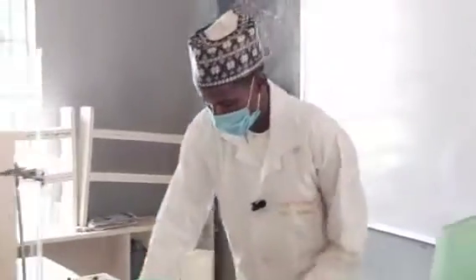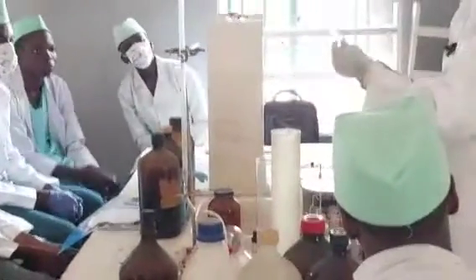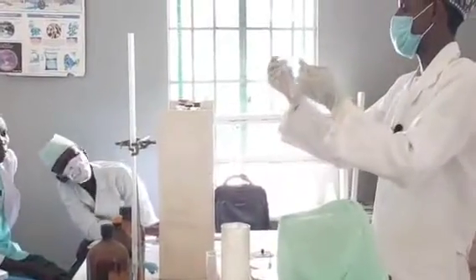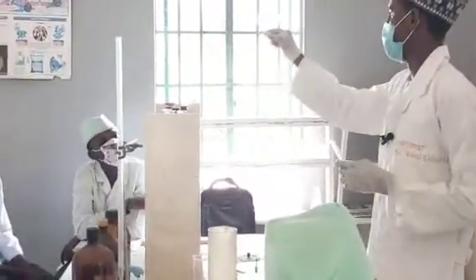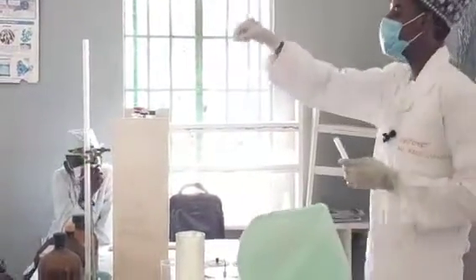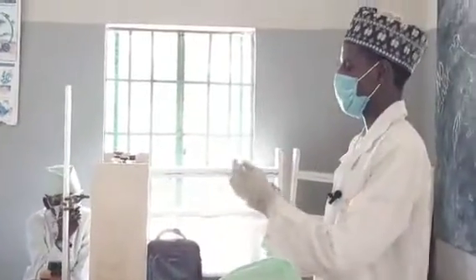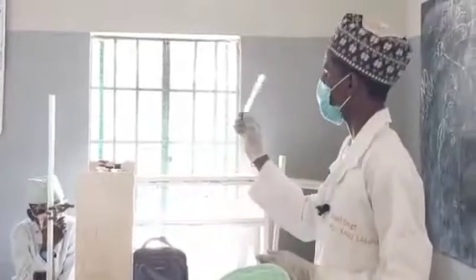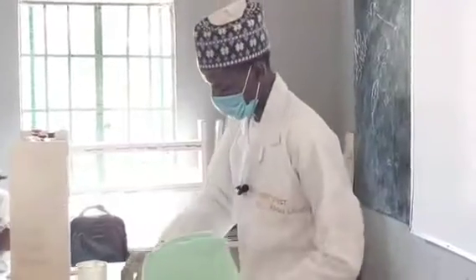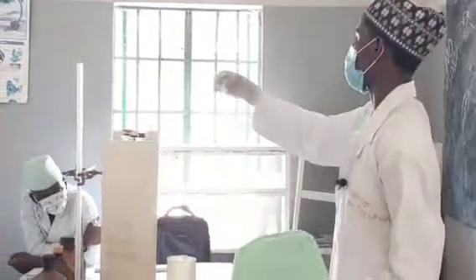Even the test tube, we have many different types. Like this one, Pyrex is written, meaning you can heat this one. If it is not labeled, you are not going to heat it. If you do, it's going to break. Like this one, it is not written Pyrex or borosilicate glass, so you cannot heat this. We have different sizes of test tubes, but mostly the test tubes are not graduated.